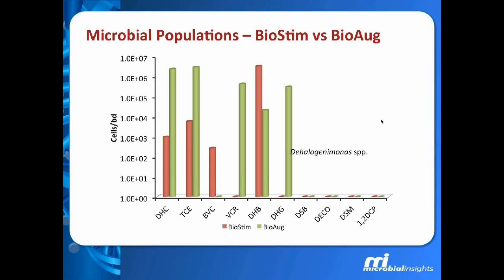Is there any bacterial species that you found most effective in biodegradation? This question is not specific to any type of contamination, but maybe drawing from your experience, Dora, do you see any one particular species out there that seems to be very effective for degrading any kind of contaminant? Well, it really depends on the contaminant, because most organisms have certain metabolic capabilities, and so they're not able to use a very diverse group of contaminants typically. So most of the aromatic BTEX utilizing bacteria are probably the most diverse in their capability.